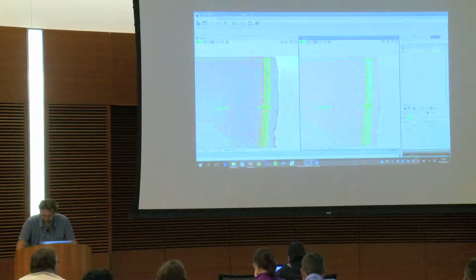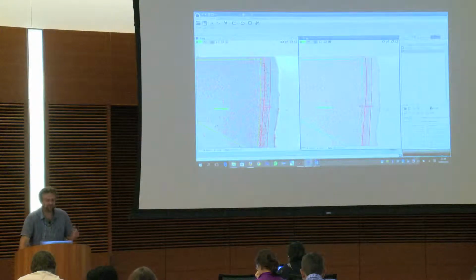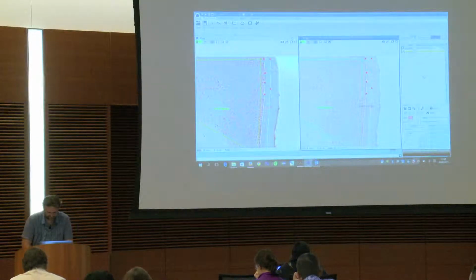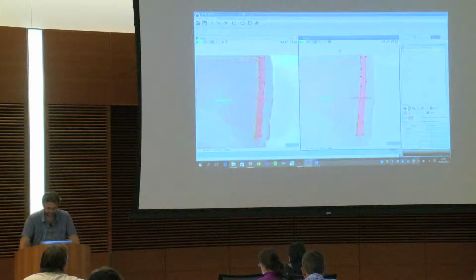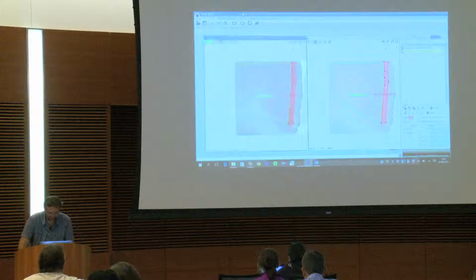You can change the color. So if I want to make it red, and as a lot of times you will export to R or to Excel, you can rename your ROIs. So here, double click, and you say here it is my high density ROI, and here you can say it's my low density ROI. Okay. And now, when you process back your data, so I lost my window.